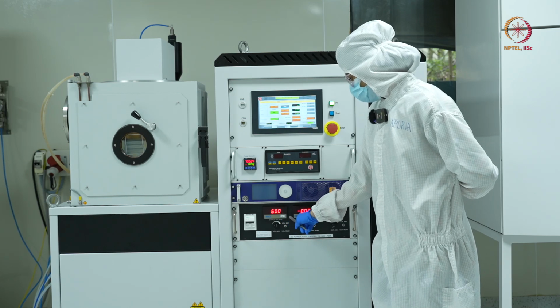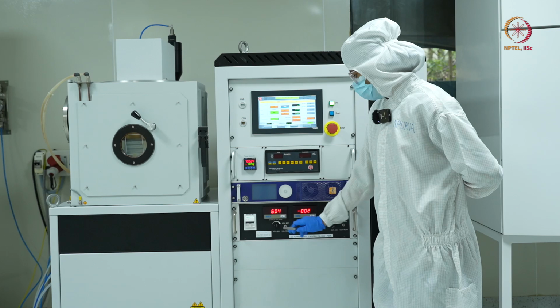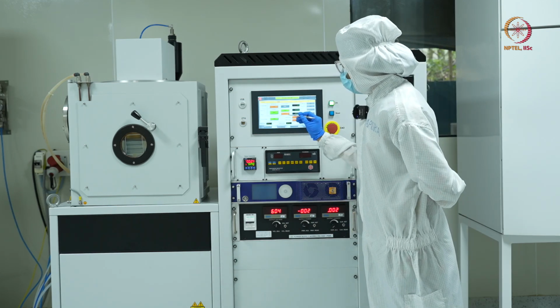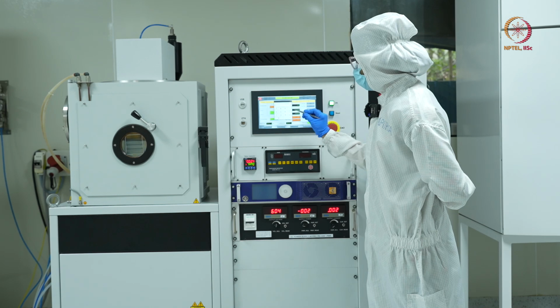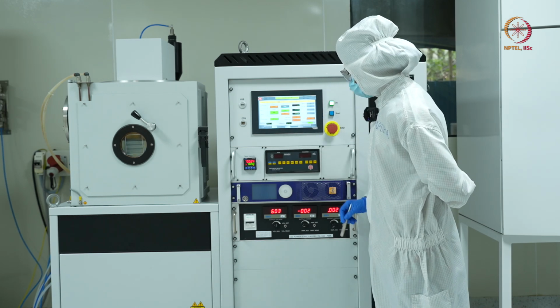Once my set voltage is 600, I'll move the toggle button to read mode. After this, I'll give the argon supply as 5 SCCM.